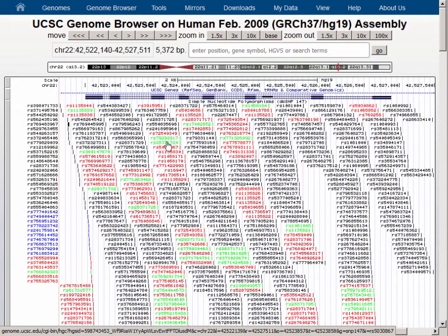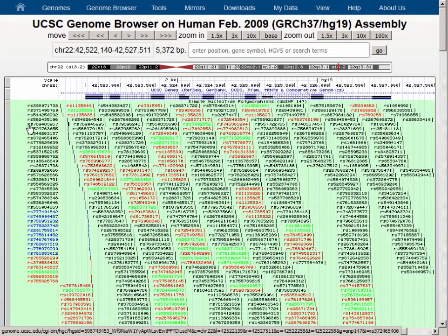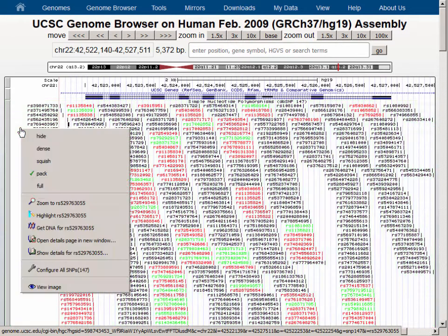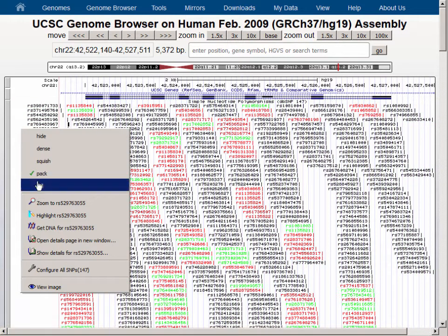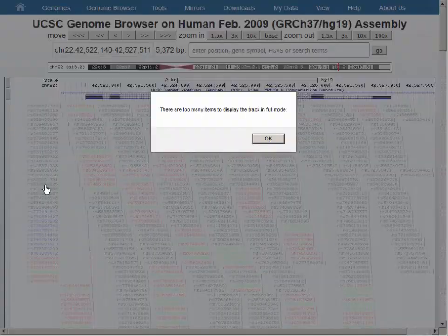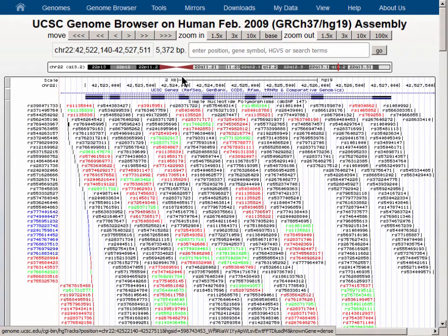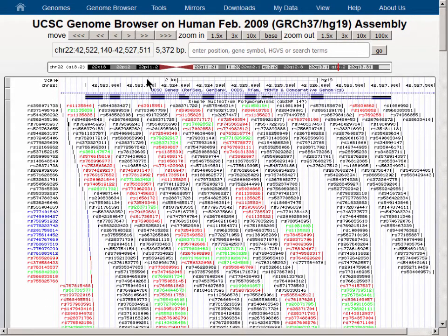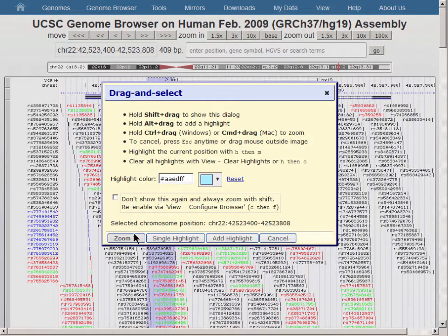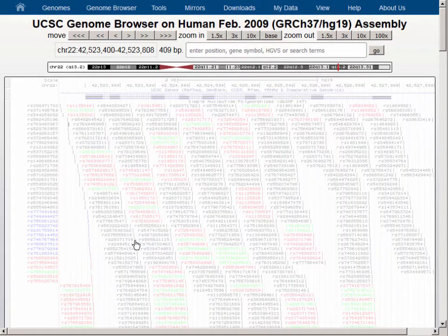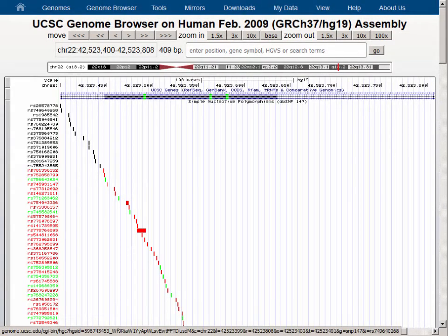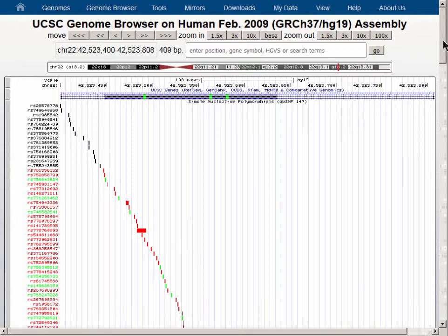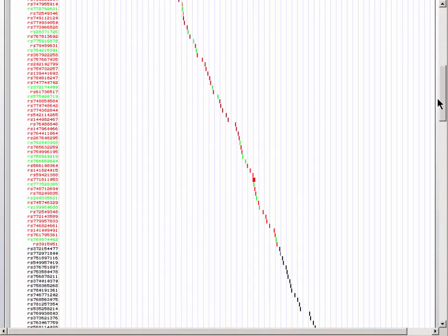Let's switch this track to Full now, and we'll see too many items to display. So let's zoom in farther to a single exon, and you'll see that in Full mode we have a similar display to the UCSC Genes track, where each SNP is on a single line with the labels down the left side and a lot of white space on the screen.